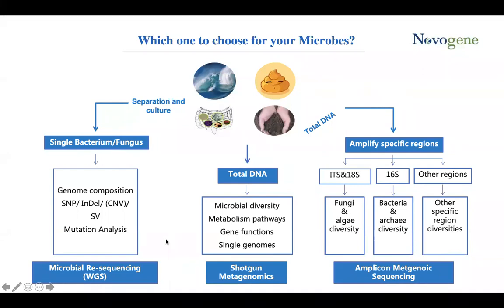And let's take another question. This is from an anonymous attendee, but it's a very good question. Since PacBio allows for a greater amount of classification, does it use more starting material to obtain this, or is the sample requirement the same for both types of sequencing? It's definitely not the same for PacBio and Illumina, since you use more in PacBio sequencing. I can share with you the sample requirements for both the PacBio platform and the Illumina platform by email after this webinar.